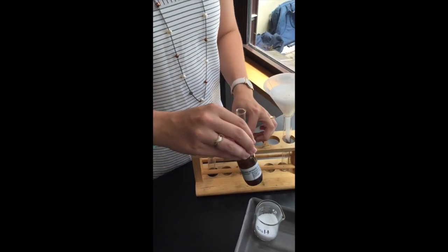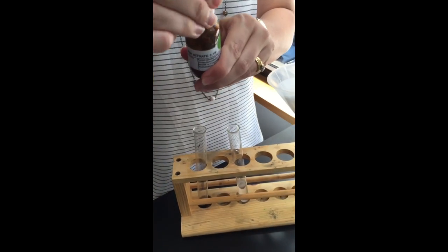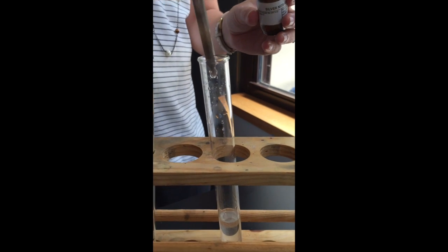Once you've got the salt and water mixed up nicely, get the silver nitrate and place a few drops in it. You can see immediately that it goes cloudy in the test tube, which indicates the presence of chlorides.